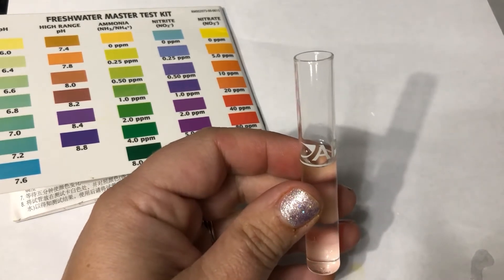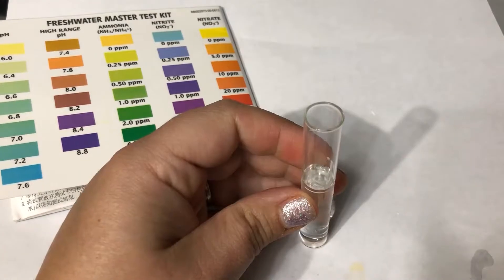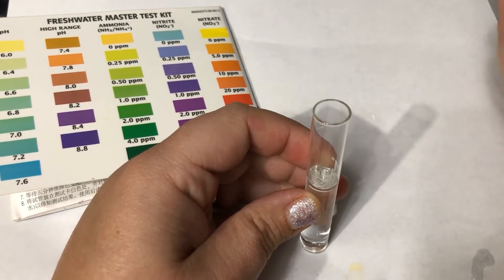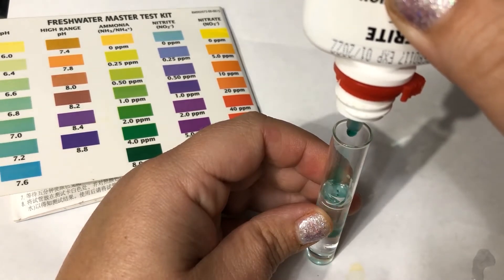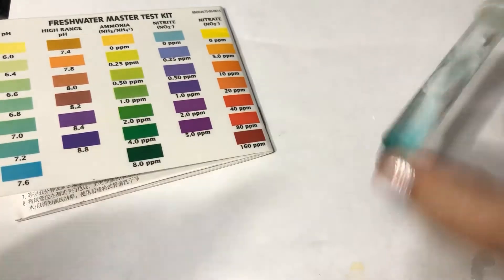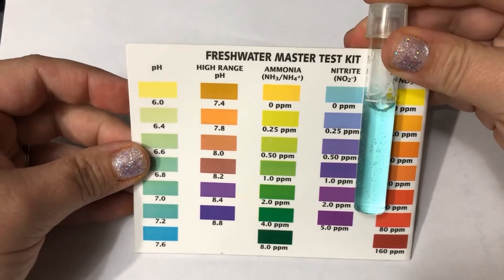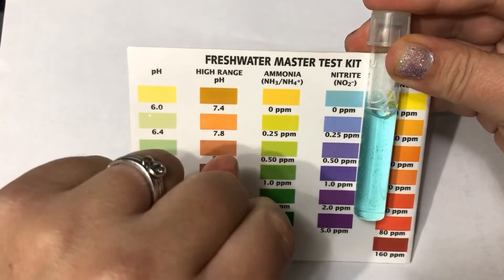I've dumped and rinsed my tube again and added five milliliters of tank water to work on the nitrite test. Remember, nitrite is the first waste that ammonia-eating bacteria produce, so we want to see this start to show up as the tank becomes established. I'm going to put the bottle straight up and down and squeeze five drops, put the cap on, and shake for five seconds. We let it set five minutes. As expected in this first week, we're not going to see any nitrite yet — we don't have enough ammonia-eating bacteria producing nitrite, but we should see it next week.